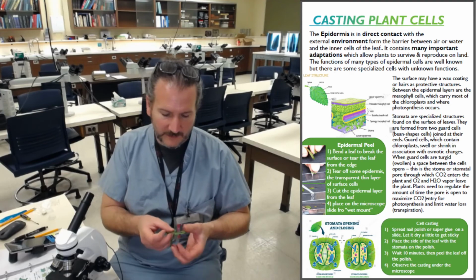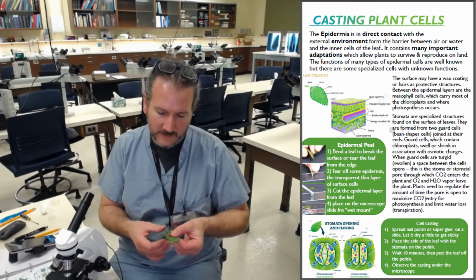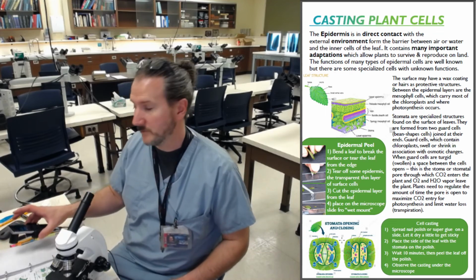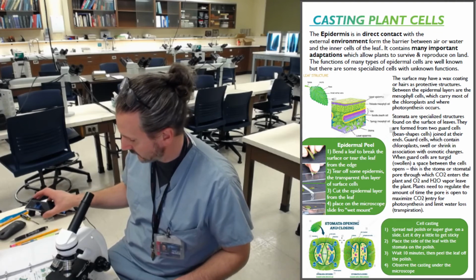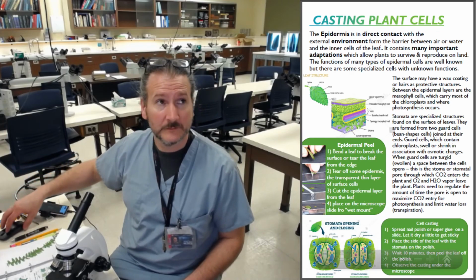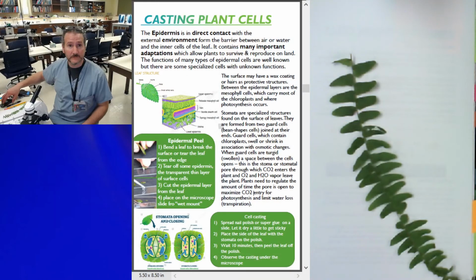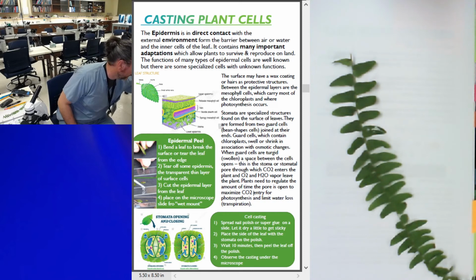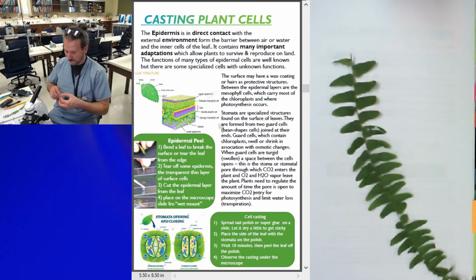And set this down for a minute. There. I'll let it kind of start drying. In the meantime, grab your tape. It has to be clear tape. There's the edge of the tape.